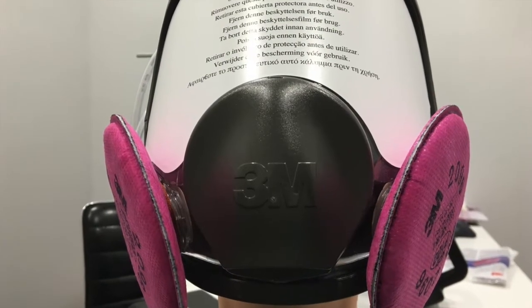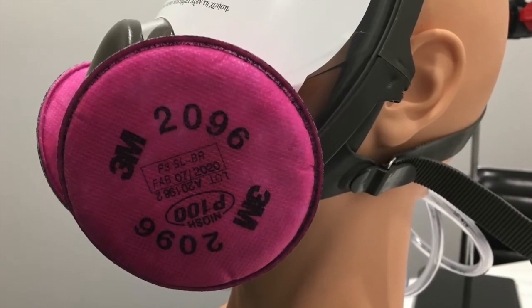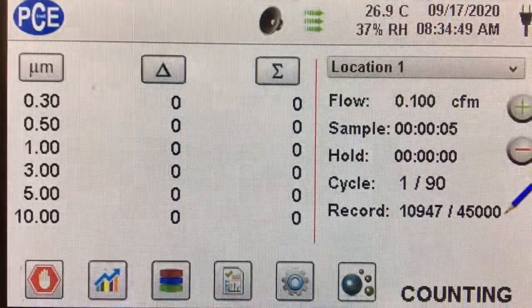Here's a picture of the filter mounted on our 6800 3M mask. Here's a picture from the side, and here's a video of us testing the filter, with the air going through the filter, going into the mask, and into our PCE particle counter.